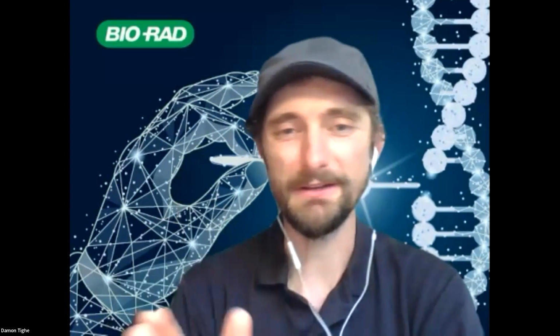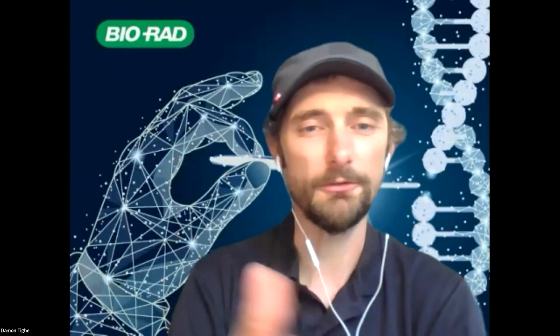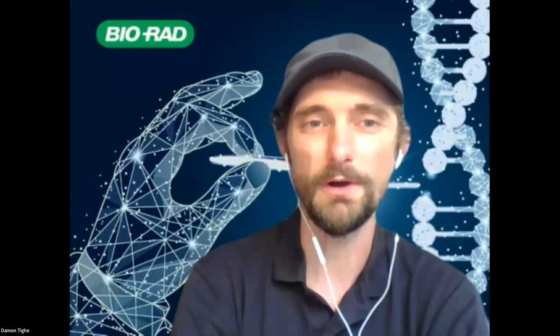You could use other proteins for this lab. You're not restricted to milk and a high protein drink. You could use pea proteins. You could extract proteins from nuts, and I think that is part of the other webinar that Vernier and I did last year, where we show how to do that. So you can bring in whatever source of protein you want as long as you can get it into solution.